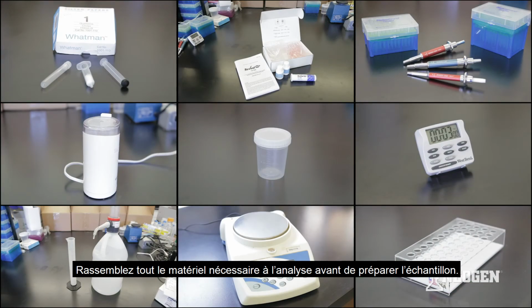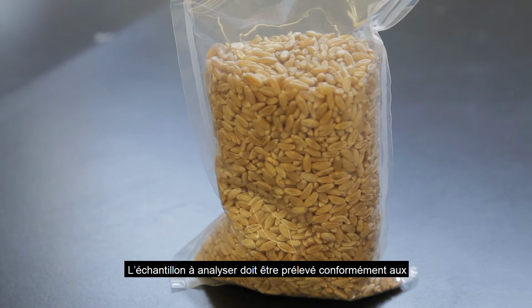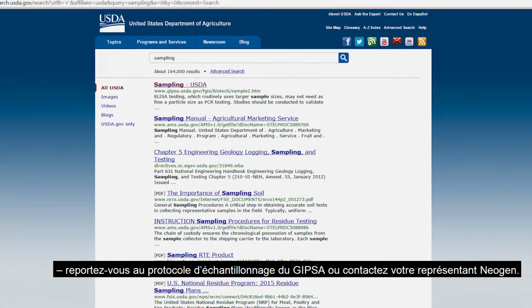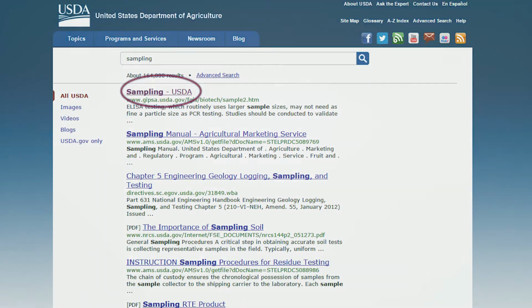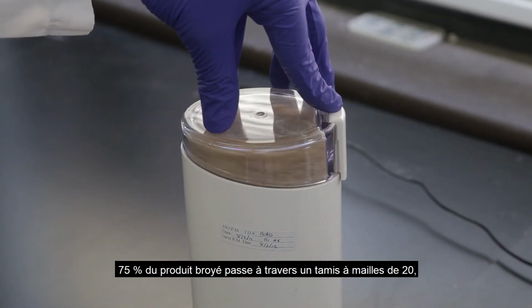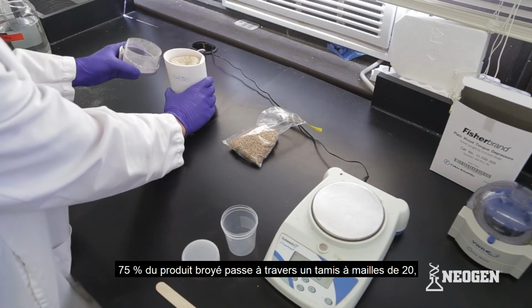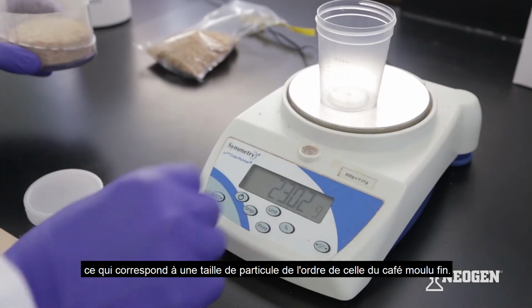To prepare the sample, begin by gathering all of the materials required for the test. The sample to be tested should be collected according to accepted sampling techniques. See the GIPSA sampling protocol or contact your Neogen representative. Obtain a representative sample by grinding a minimum of 100 grams of sample so that at least 75% of the ground material passes through a 20-mesh sieve. The particle size should be about the same as instant coffee.